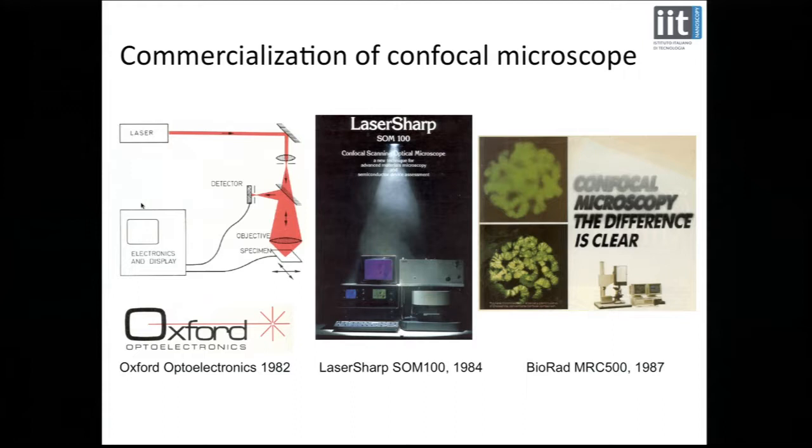In 1987, Bio-Rad brought out this MRC-500, which I have to admit was not our design. This is a beam scanning system. Ours was a stage scanning system at that time.